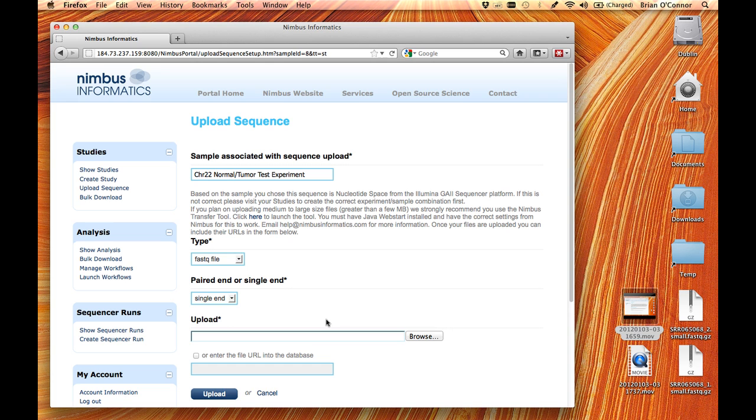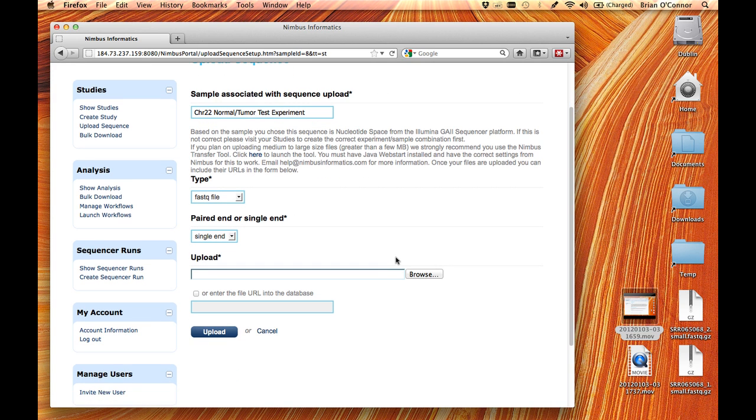Now, as I mentioned, if you're looking at data sets that are over about 4 gigabytes, typically whole genome data sets, you really want to explore hard drive import options, which are actually surprisingly easy for Amazon. And we can work with you to make sure that works well. But for smaller data sets, whole exome, we recommend using our import-export tool, which you can launch here by just clicking on this application link.